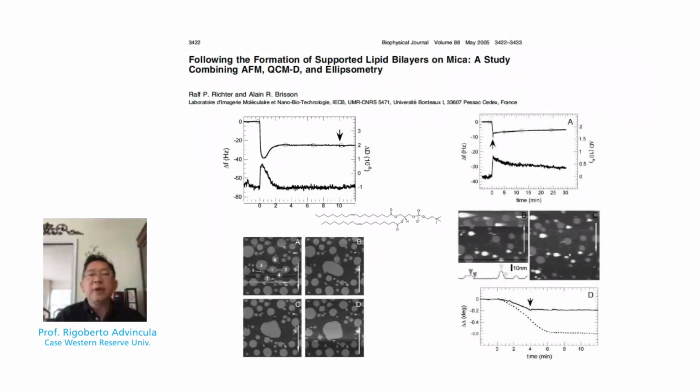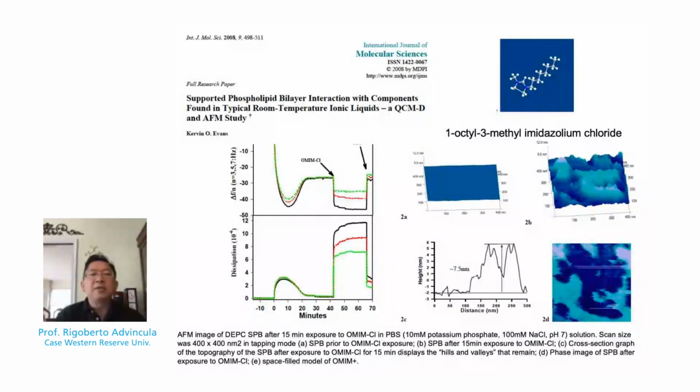Now here we have another paper, author Evans, published in the open access International Journal of Molecular Sciences, which shows the frequency shift observed for a supported lipid bilayer interaction. I believe this was done both with the mica surface and the modified gold surface in the presence of an ionic liquid, 1-octyl-3-methyl-imidazolium.